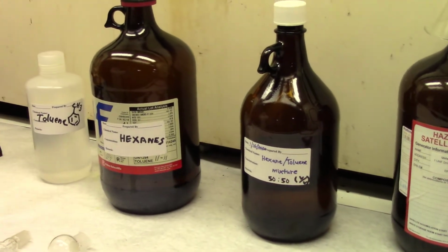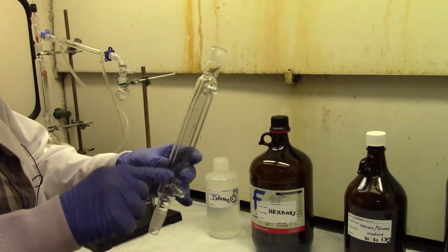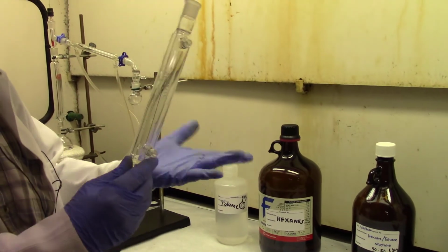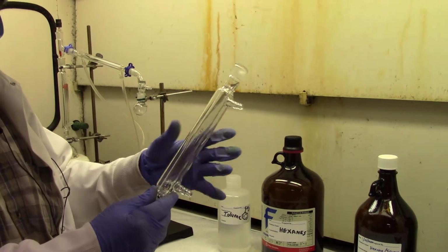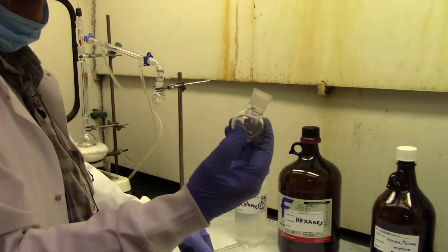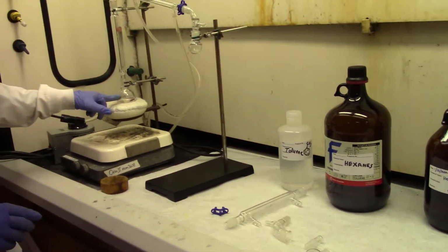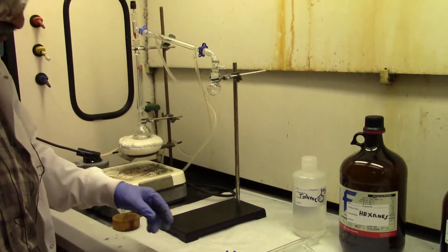And this is the condenser. We'll be using two condensers, one with the inner tube wider and the other with the narrower inner tube. This is the 25 mL round bottom flask, and the other one is the 100 mL round bottom flask.